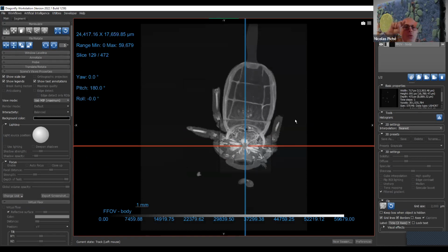For each voxel I do an integration, well, not an integration; in that case I take only the maximum. In medical use, this helps find a small tumor in a big data set. They slide like that and poof, they find the bright spot. If you're working on lung, usually you want the reverse, the minimum intensity projection. In that case, maximum is not very appropriate.